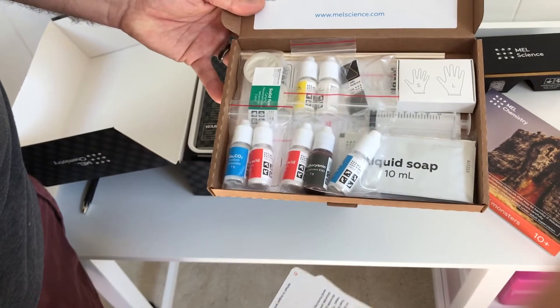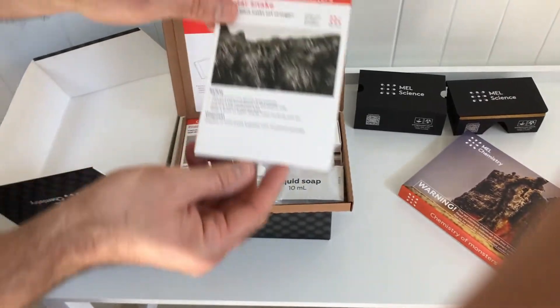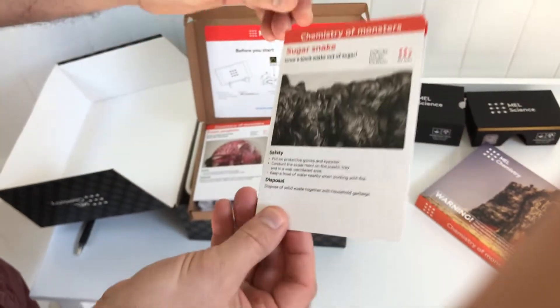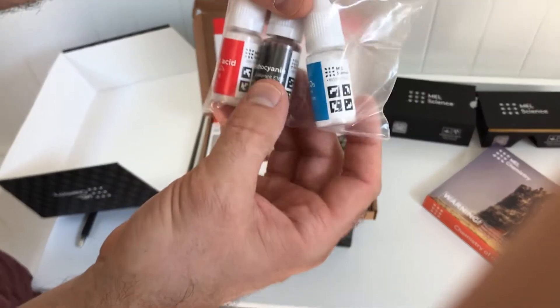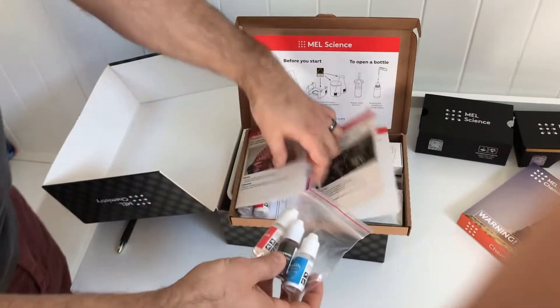You can take a quick look in there and see everything. Here are the actual instruction manuals — these are the instructions that explain how to do the experiment and they also explain the science behind what you're doing, so you can actually learn something while you're having fun.